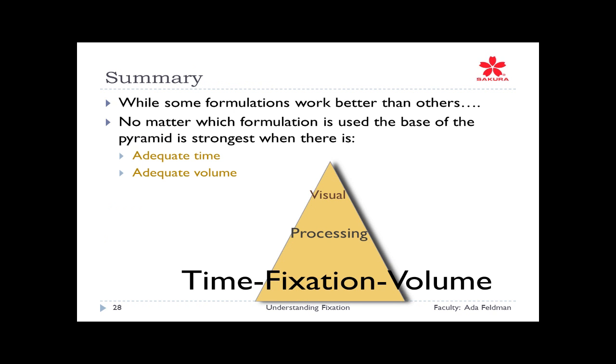So in summary, while some formulations definitely work better than others, especially those that weren't designed to be an antiseptic like formalin, no matter which formulation you're going to use, remember that the base of this pyramid, which is fixation, has to have adequate time and adequate volume. Questions?